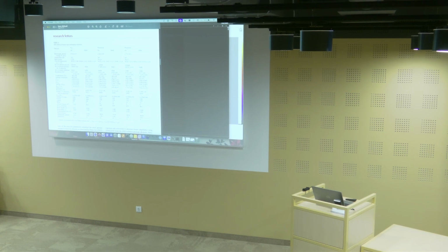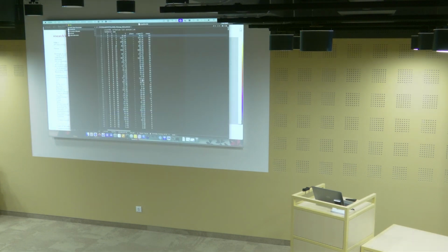So yeah, we don't have such a great coverage of the data. Here they report the average redundancy. So the redundancy is the amount of times we measured that reflection, or we measured part of the reflection. So that's like 800. So yeah, the values that we have here are definitely not good enough. However, we get our list with intensities and standard errors, so we can do something with it.